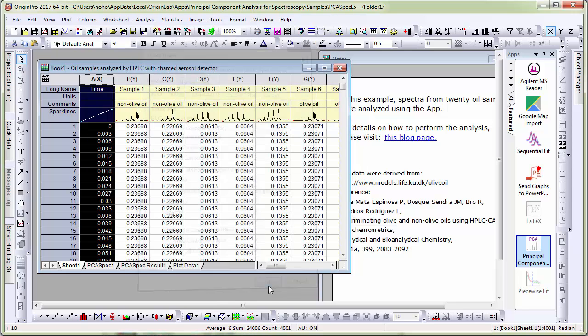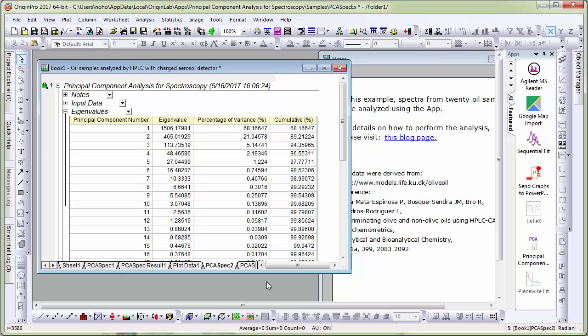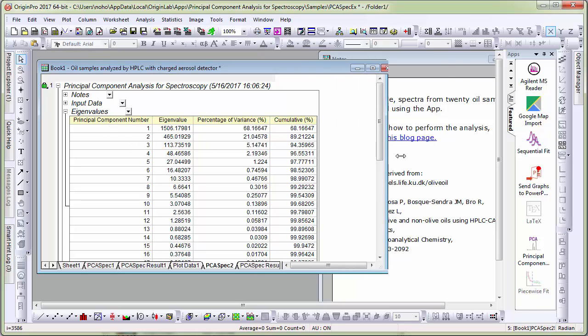Let me click OK. Origin performs, the app performs the computation. Then I can go to my report sheet which has several tables.